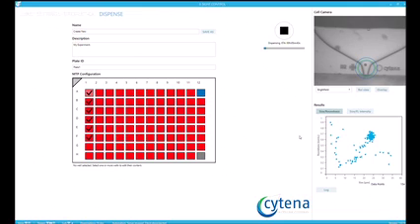The progress can be monitored by looking at the plate. Each time the check mark occurs, a single droplet with a single cell was dispensed into the respective well. For 96 well plates, this takes typically between 2 and 5 minutes.